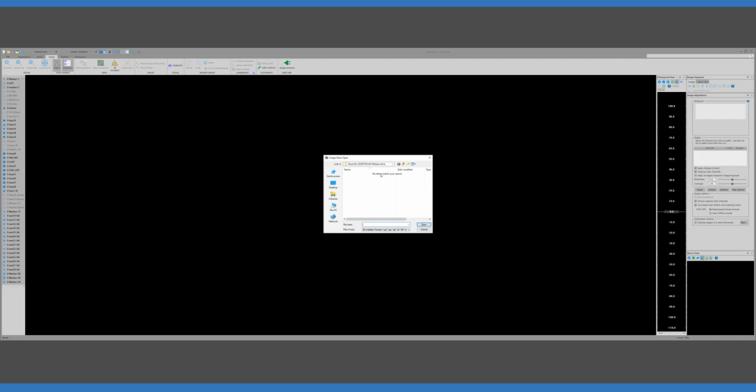What I'm going to show now is some of the post-processing that we do on these stacks. Yeah, so I think where you're going is you're going to show a new illumination correction feature that we just recently developed that applies to counterstains or any sort of labeling that has really wide coverage.